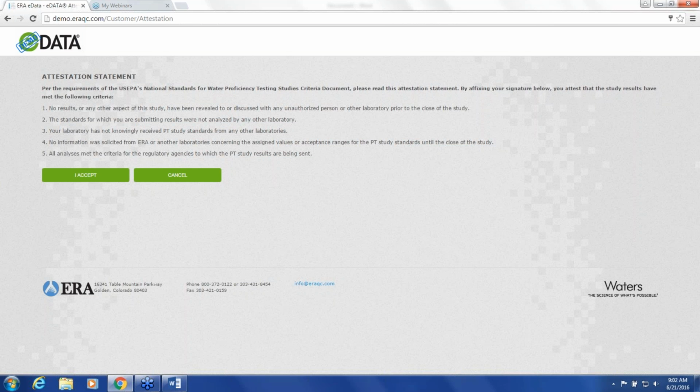The demonstration I will show you today is actually from a separate website that we maintain solely for the purpose of performing demonstrations. We maintain this site so we do not risk compromising our customers' confidential information by potentially showing it to others. As a result, some features of our demo website are not fully populated with rich data sets that allow me to completely showcase the benefits our site has to offer. For that, I apologize. If you are familiar with eRA's eDATA website, you will recognize what I'm referring to, and if you're not, I encourage you to spend some time becoming more familiar with it.